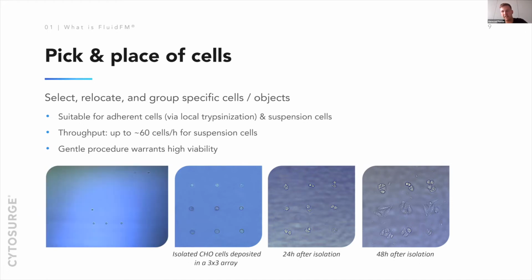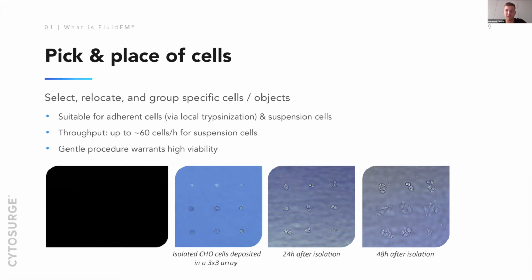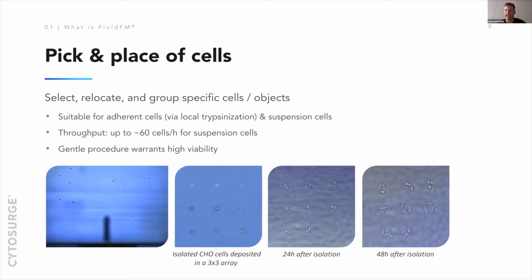So as you can see, we constantly have feedback from the microscope, which means that we always know which cells we are sorting. And especially when people want to edit some genes, normally with CRISPR-Cas9 complexes, then it can be very important to sort the cells that have been edited to make monoclonal cultures from a polyclonal edited culture, for example.